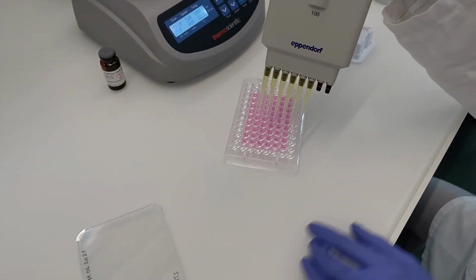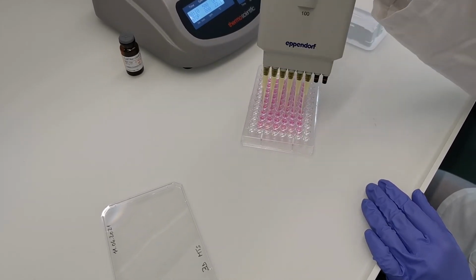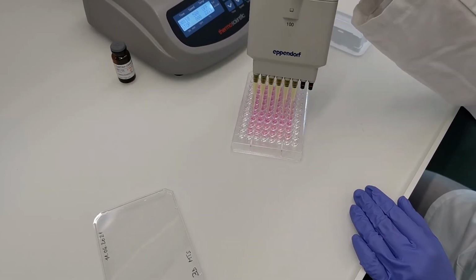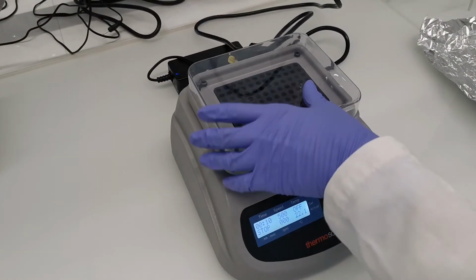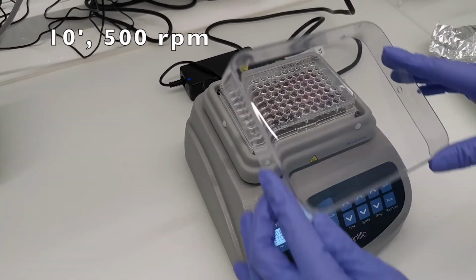An equal volume of Cell Titer Glow to medium is added, in this case 100 microliters, and the cells are then lysed on an orbital shaker for 10 minutes at 500 RPM.